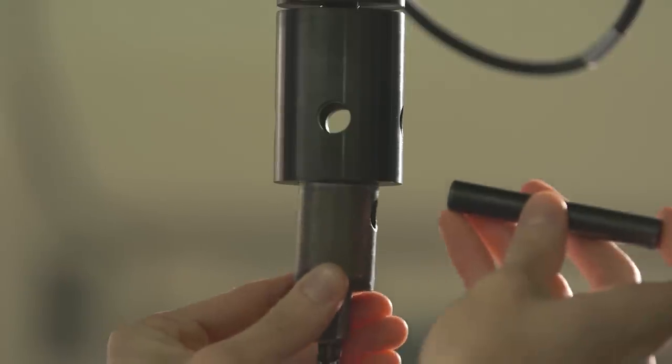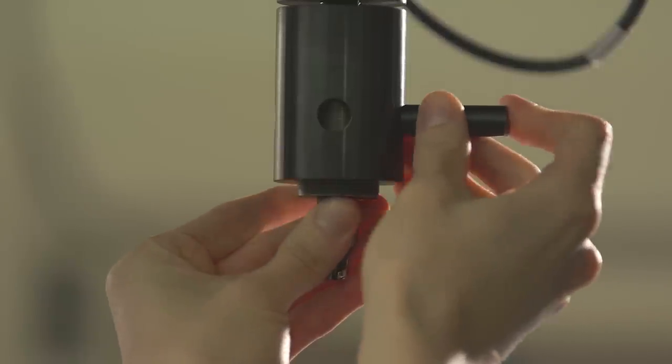I'm Craig Mitchell. We're here at Sturbridge Metallurgical Services, an independent laboratory that specializes in the testing and characterization of metallic components.